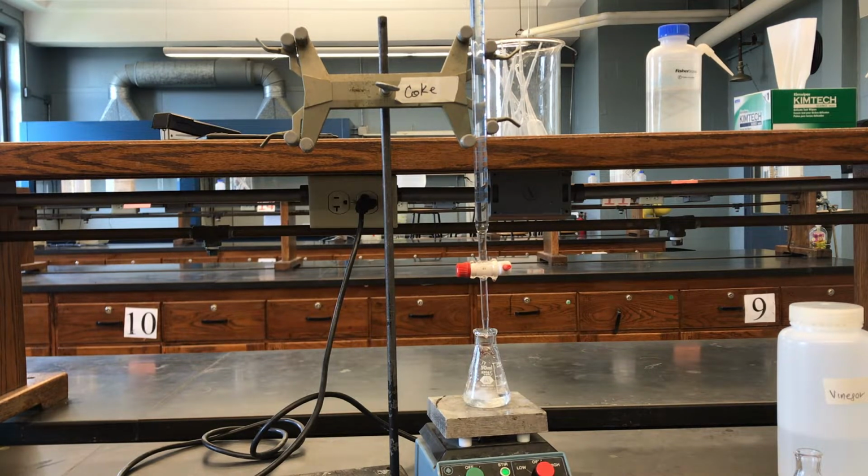But remember, with the titration in a burette, you have to know the initial volume of the burette and the final volume of the burette in order to figure out exactly how much sodium hydroxide, or how much of your titrant, you deliver to your analyte, which in this case is our acetic acid in the vinegar.